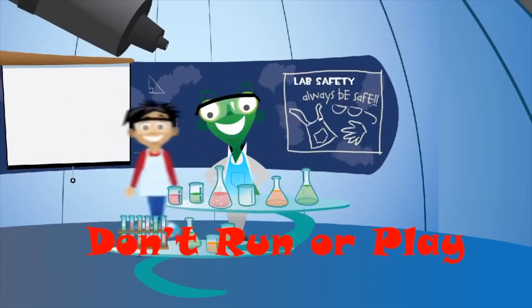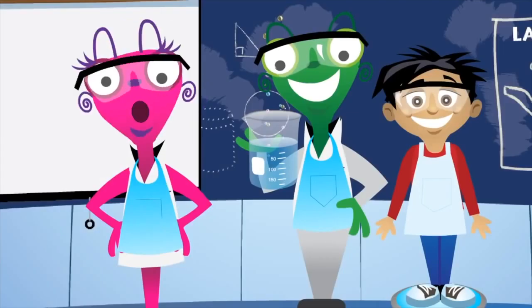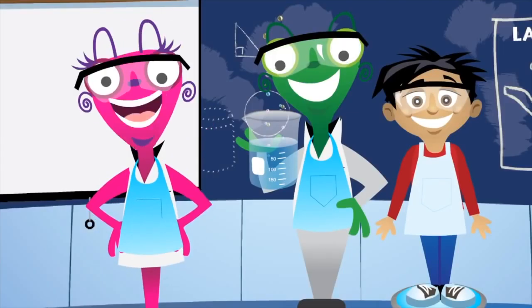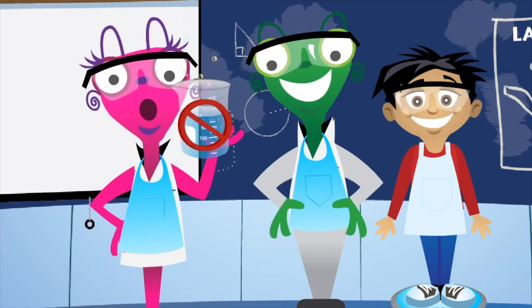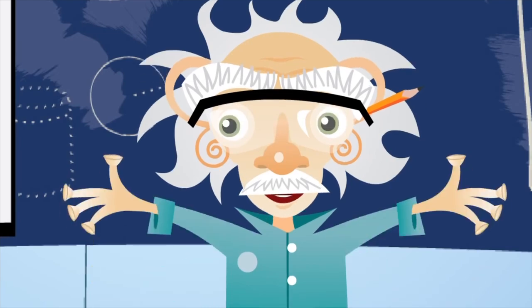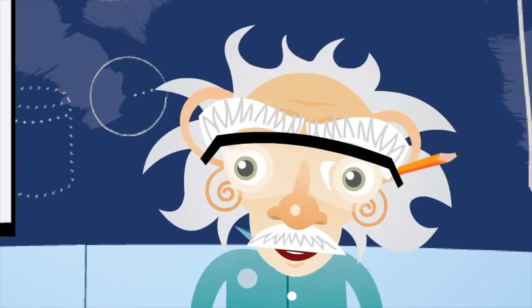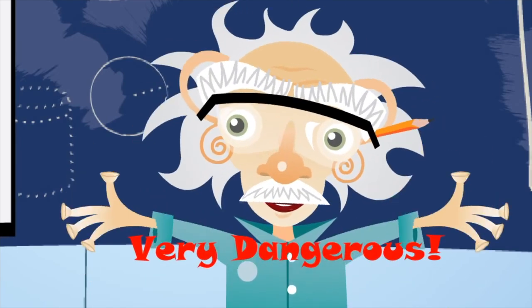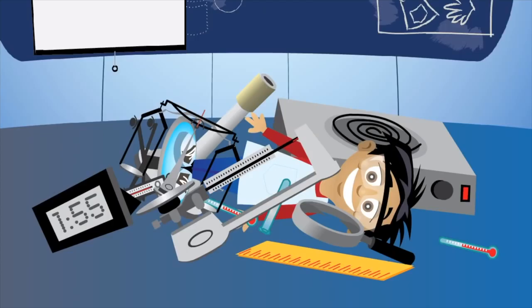Running and playing in the lab is something you should not do! And don't drink or eat anything when you don't have a clue! Without a doubt, it will look very interesting! But, it could be very dangerous! Please be careful!